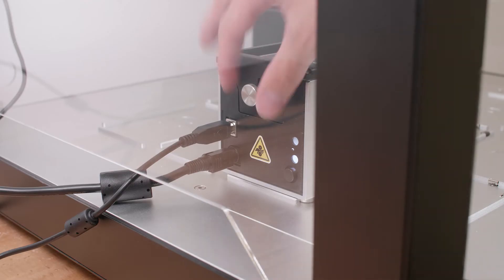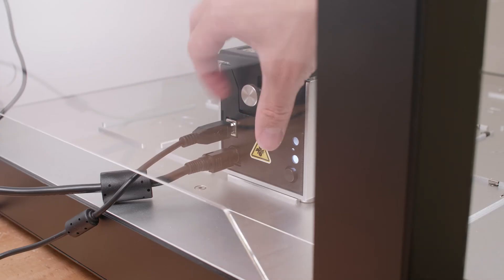Adding labware to your magnetic module is as simple as unscrewing a latch, placing your labware, and locking it down.